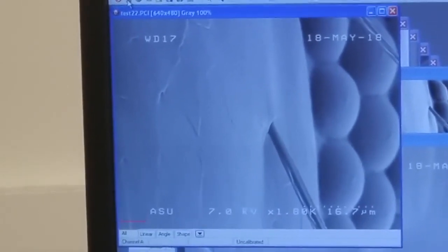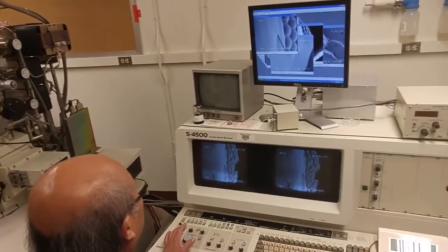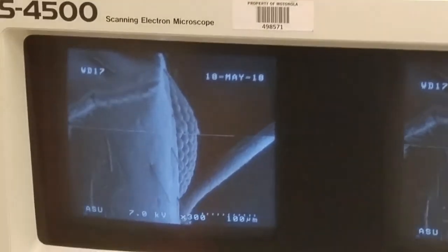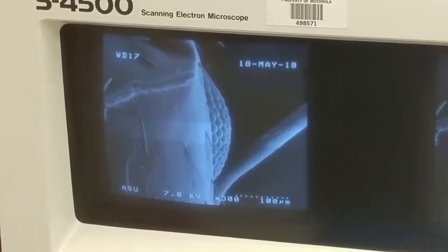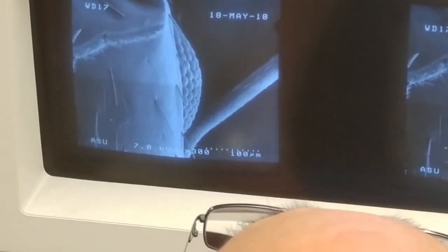One more? No, I think you're good. Okay, alright let's start. We'll press the scan a little more further. We'll move just in case. Progress, contrast. We'll move just in case. So we'll scan 4 — 4, 2. Save the file once the scan is completed.